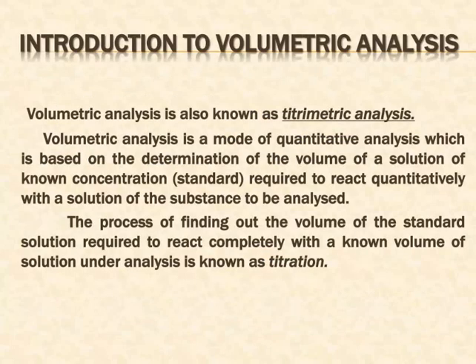So, let us start from scratch. What is volumetric analysis? Volumetric analysis is also known as titration analysis. Volumetric analysis is a mode of quantitative analysis which is based on the determination of the volume of a solution of known concentration, a standard, required to react quantitatively with a solution of the substance to be analyzed.